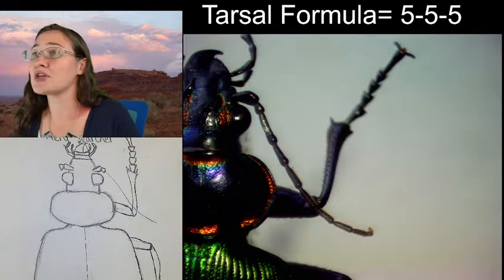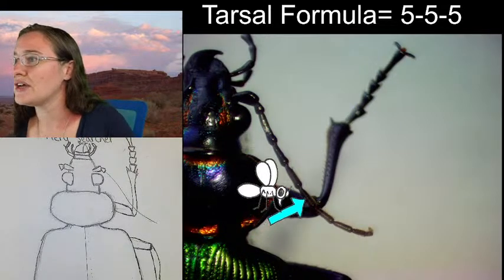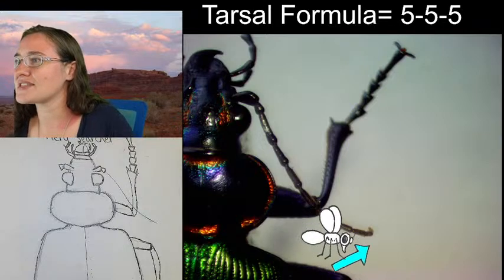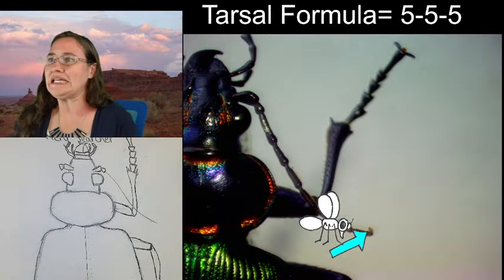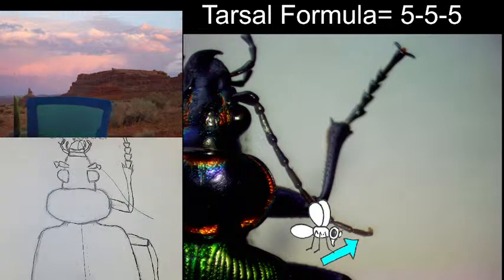And then I'm going to go ahead and count these flagellum segments. So that's 1, 2, 3, 4, 5, 6, 7, I believe 8. It could be 9. Let me look on the microscope real quick.